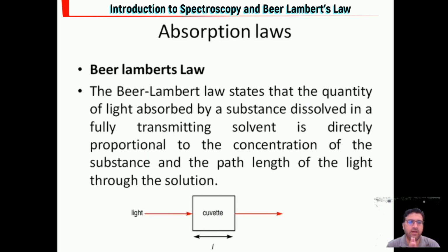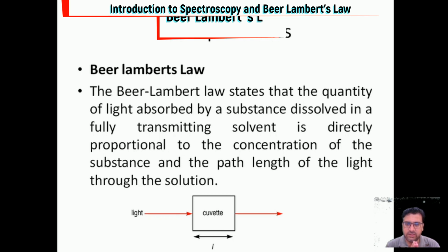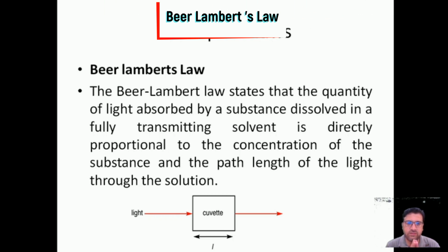Absorption laws. Beer-Lambert's law. The Beer-Lambert law states that the quantity of light absorbed by a substance dissolved in a fully transmitting solvent is directly proportional to the concentration of the substance and the path length of the light through the solution. Let's try to understand this concept with the help of the animation.